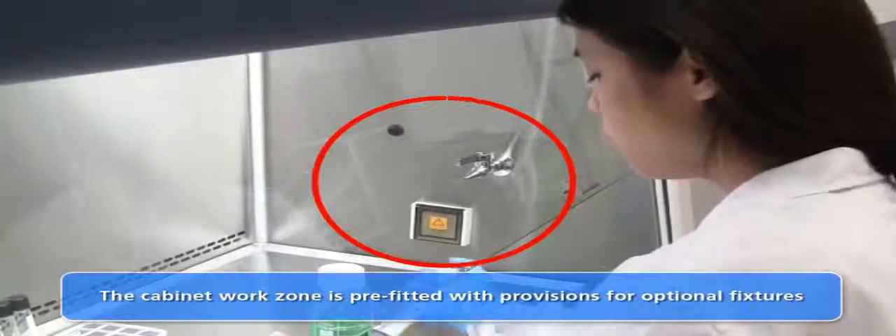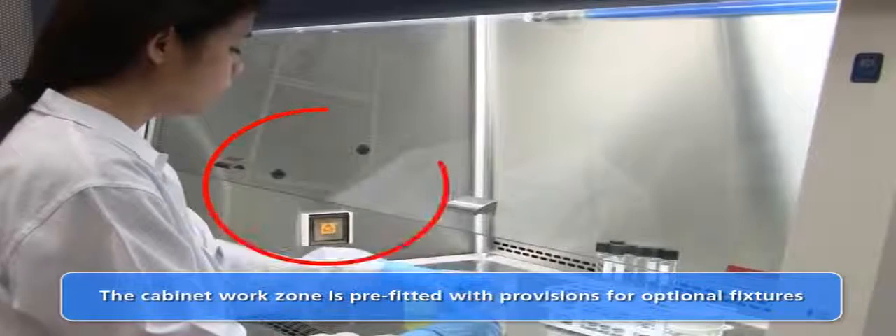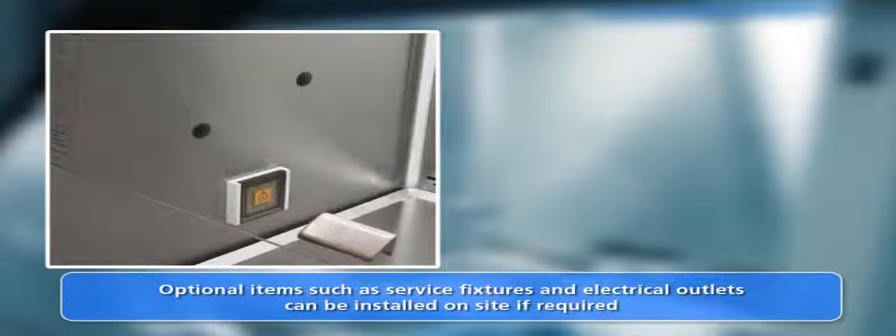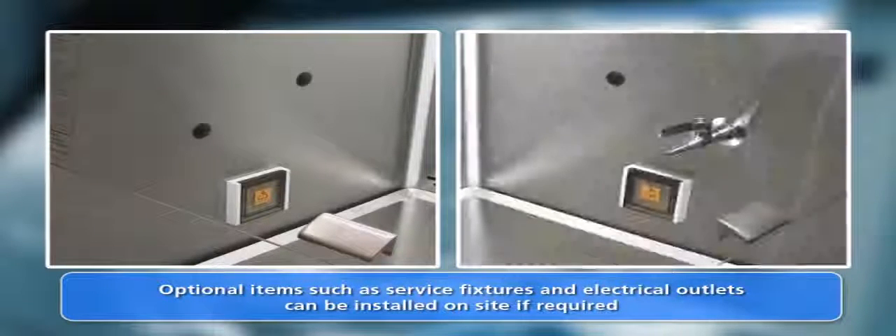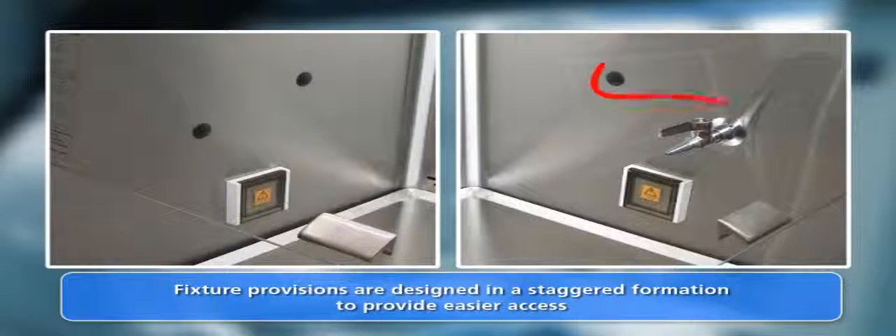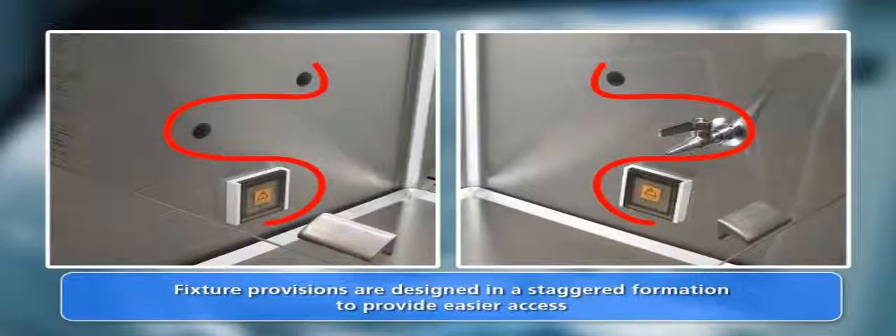The LabCulture cabinet may be fitted on site with accessories after purchase. No modifications to the cabinet body are necessary — simply install the accessories in the pre-fitted provisions. All cabinet provisions are pre-fitted with the user in mind. For example, the service fixture provisions are staggered in order to provide easier access to both service fixtures.